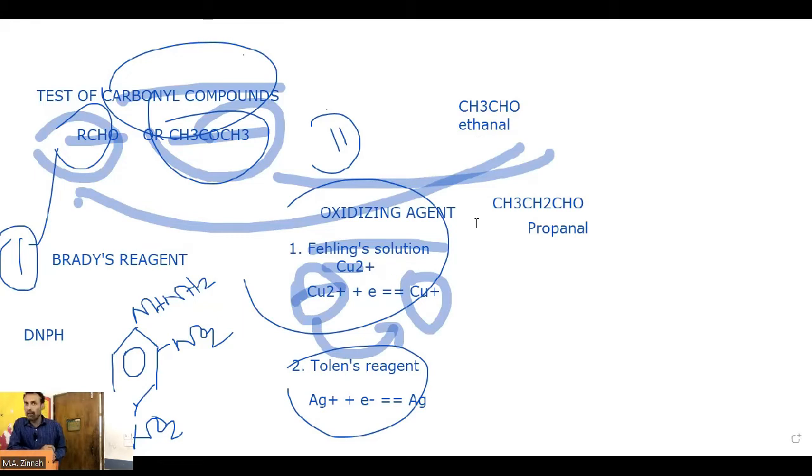It boils at 100 degrees, so this is certainly water, right? To determine a boiling point or melting point for testing, there is a condition. What condition? Yes, the sample should be pure. If something is mixed with the sample, then the boiling point and melting point will deviate from the actual value. So it must be pure.